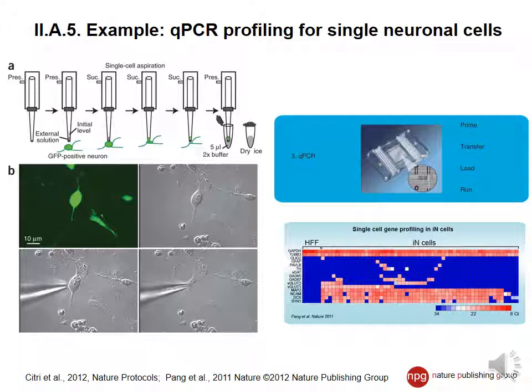And really, single cell gene profiling can provide definitive evidence regarding the conversion of one cell type into another at a really high level of resolution. And if you want to know more about this technique and how the authors applied RT-PCR in the research, you can find more information in these 2 references in Nature.